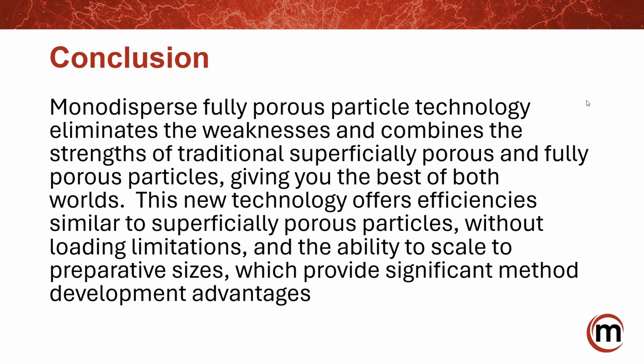Another question. How are the pH and temperature limitations for these particles compared to other fully porous and superficially porous particles? So it's silica. The significant innovation here is how the silica is being made and controlled to deliver the monodispersity.